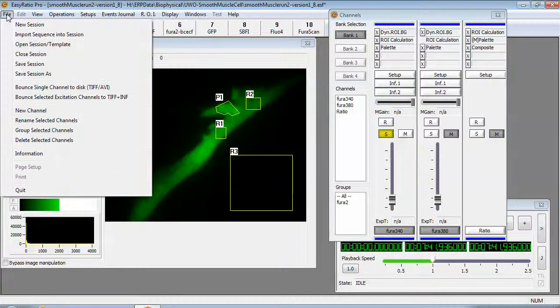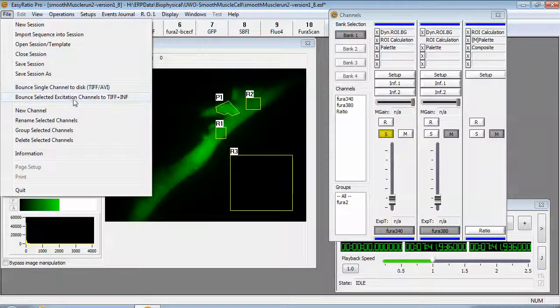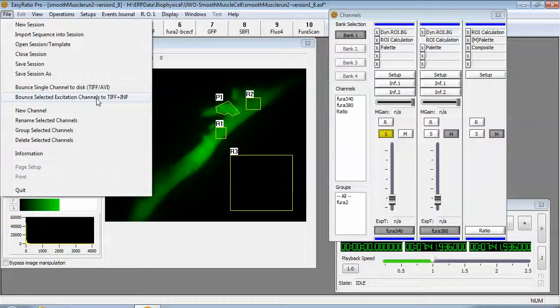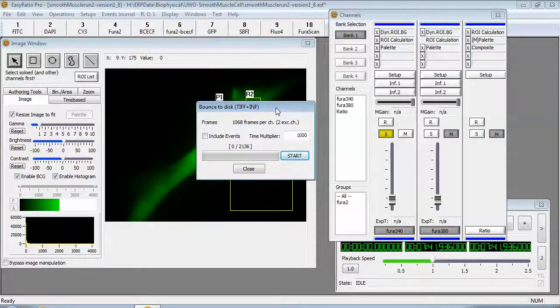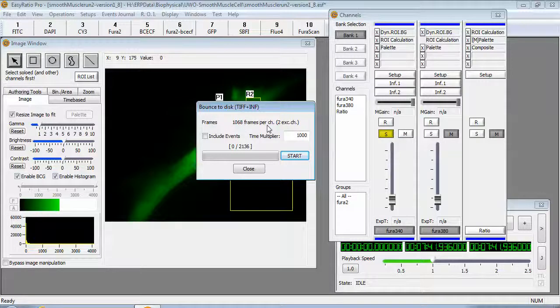Then go to the file menu and select bounce selected excitation channels to TIFF plus INF. When you do this a dialog box will open. This will tell you the number of frames that are going to be exported.